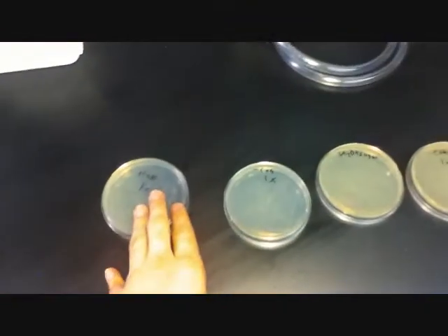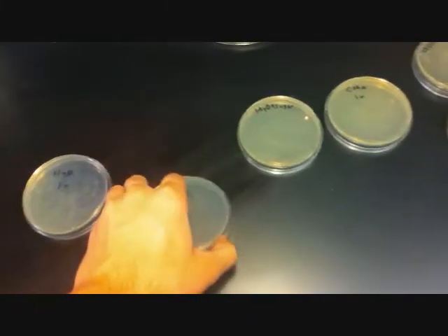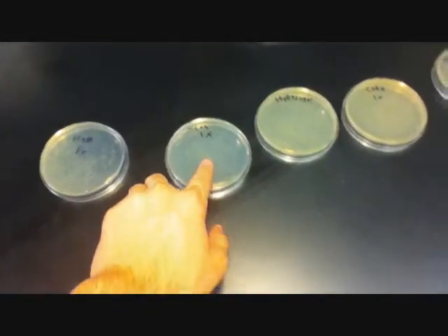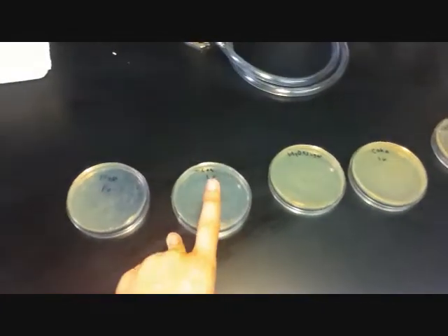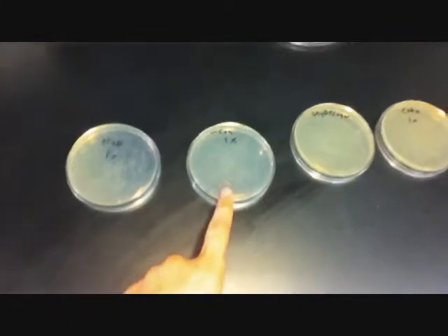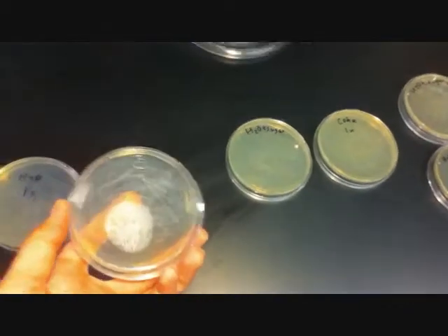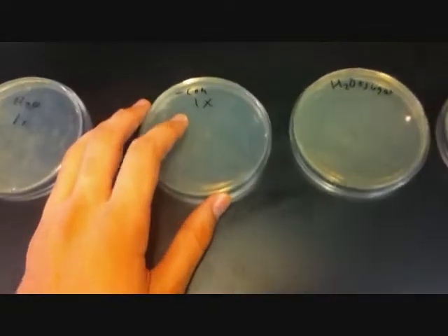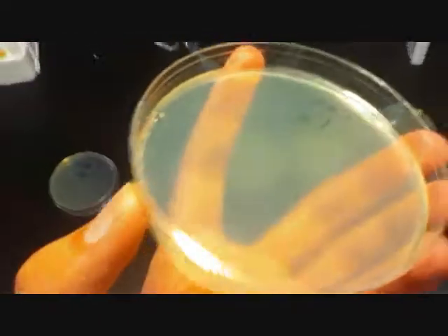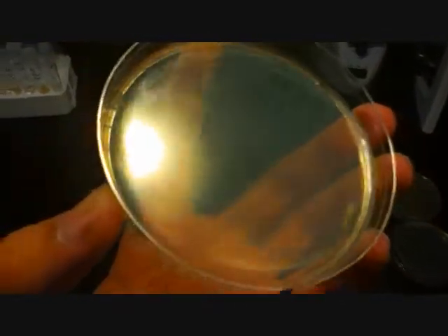It was actually about ten times — the H2O actually had ten times as much bacteria as the negative control. The negative control was in the fridge at 4 degrees Celsius, so it's suspected that there may have been some slow growth, because the bacteria can survive as long as there's liquid water. It was at 4 degrees Celsius overnight, so it should have been able to survive. The pH was fine — it was overall a pretty good place for bacteria to stay alive and probably not grow too much, but they survived.